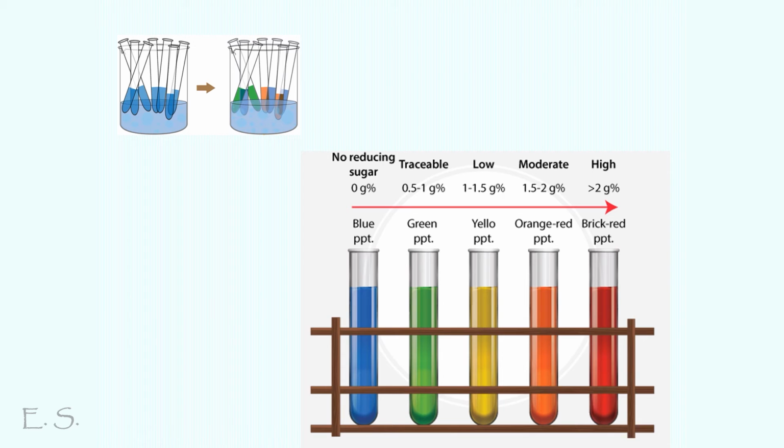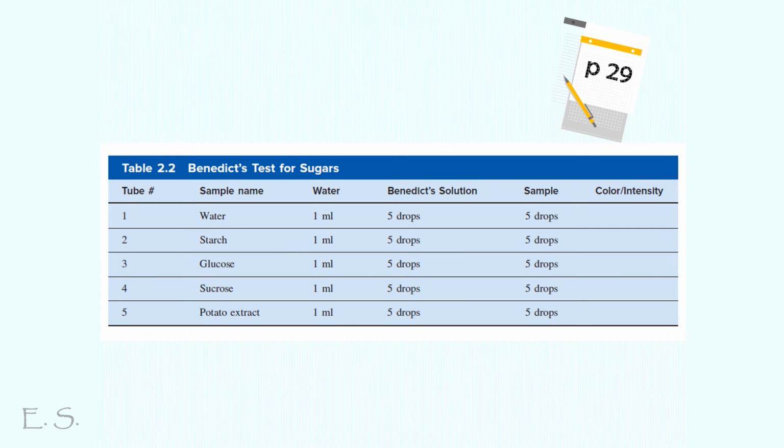The blue color of Benedict's reagent may change as indicated in this figure. Please notice what each color indicates. Once you have all of your results, please complete table 2.2 on page 29.